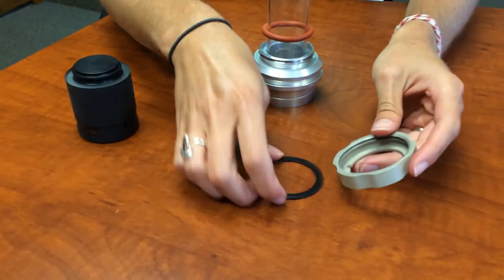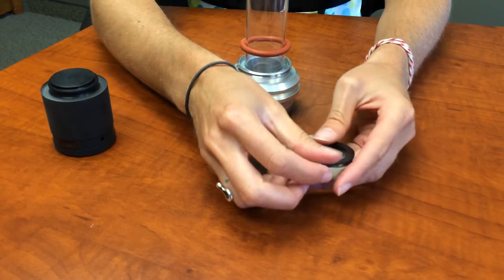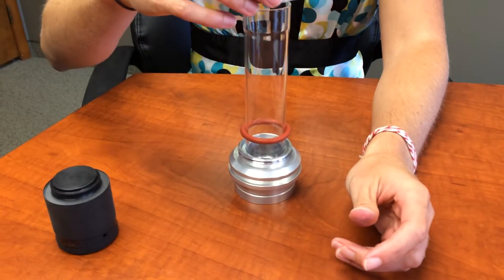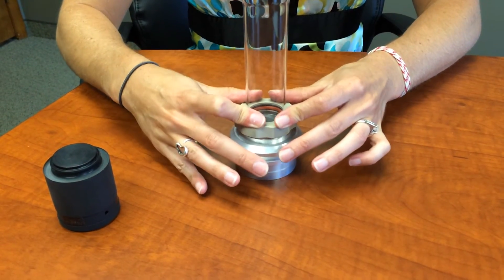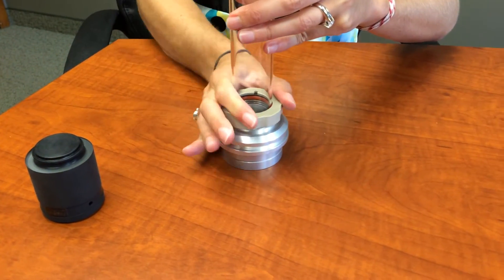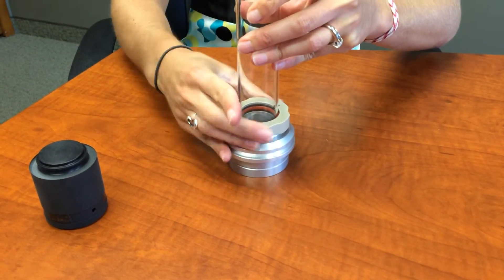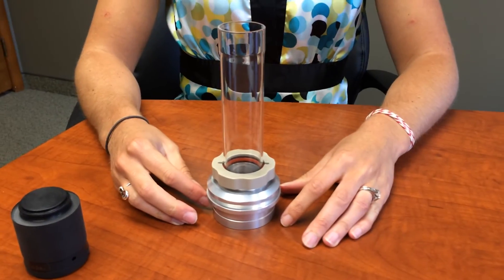Place plastic clip inside ring collar until it snaps. Slide collar over top of combustion tube, press down firmly until O-ring seals. Then while pressing, turn and tighten ring collar. System is now ready to use.